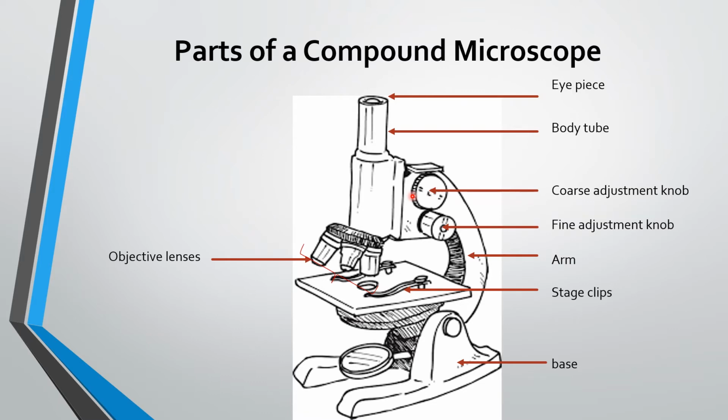microscope. And here we have the stage, and a stage is a place where we keep the slide with the specimen. And that slide is fixed to the stage using these stage clips.